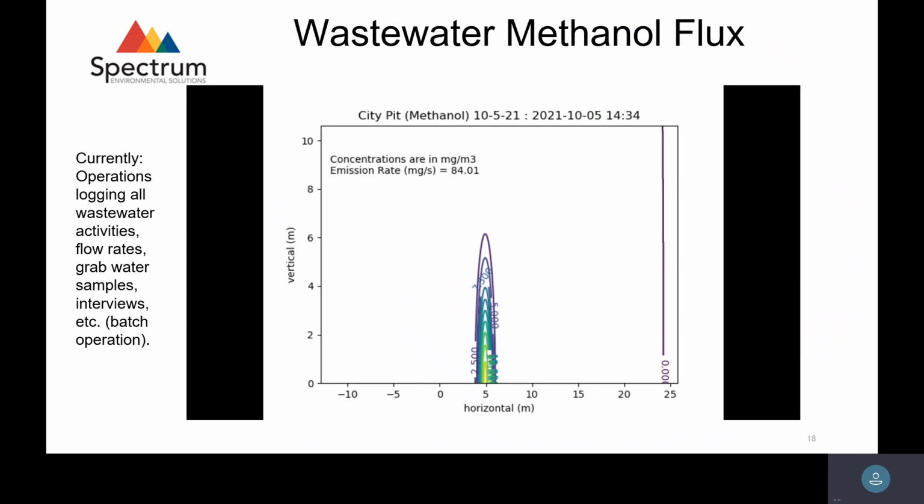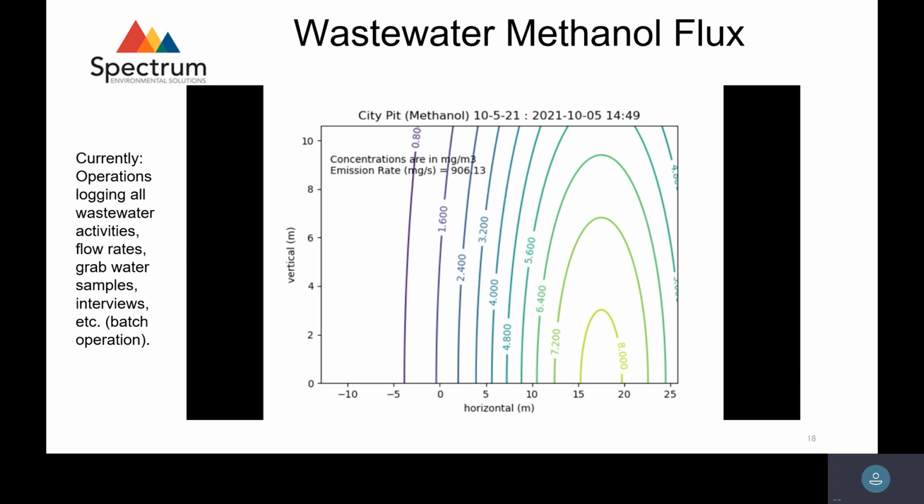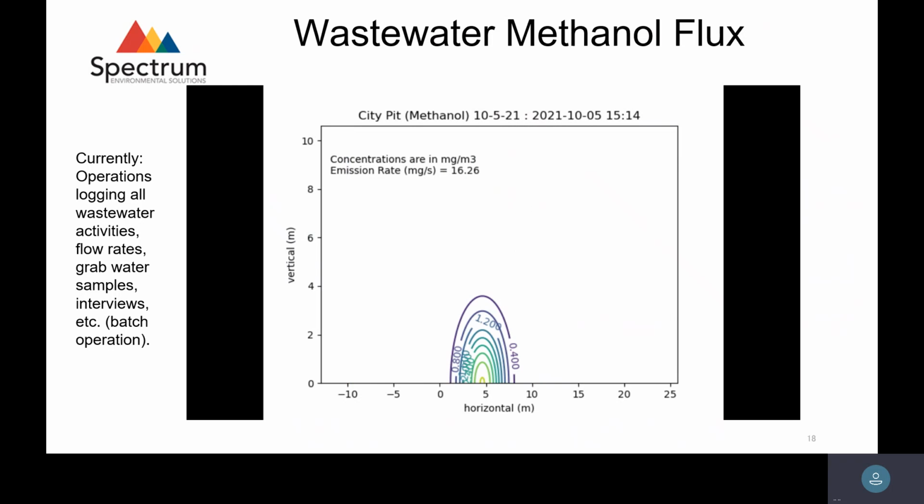So here's basically what it looks like if miracles happen, and I can start the video, but they put me into this mode here where I'm not sure I can get it to play. And I told them that this would happen. Is it moving? So every 5 minutes, you should get a different visualization of how that emission would change and move. This one would probably get thrown out by the CCF. This one we probably would keep.